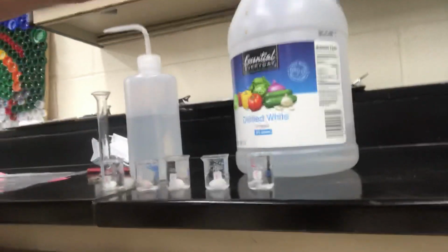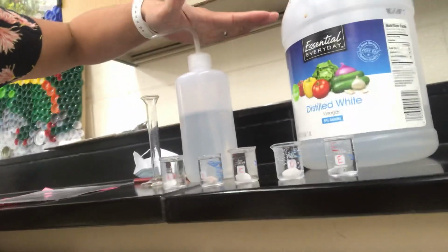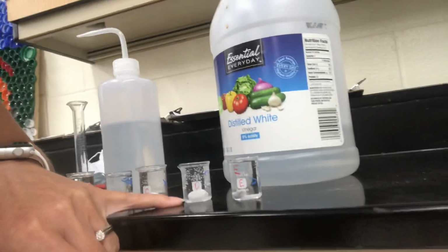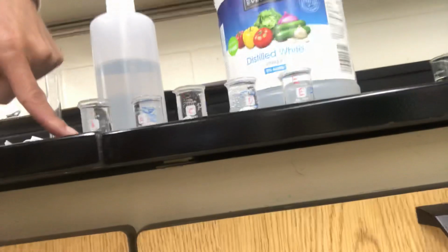Okay, so in between there are three other beakers. We've got beaker B, and it's 25% vinegar, but mostly water, 75% water. And then in the middle here we have a 50-50 ratio of vinegar to water, so equal parts. And then D is 25% distilled water and 75% vinegar, so mostly vinegar. So we have no vinegar all the way to all vinegar.